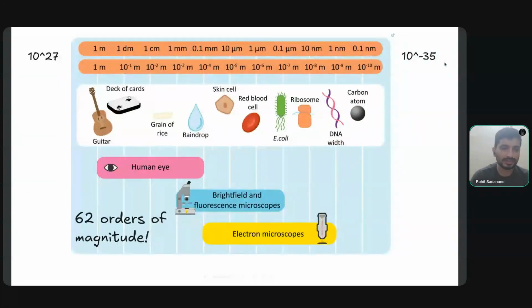Because those things that life is made up of are very tiny, and those things that affect life in a very profound manner, like bacteria, viruses, and even disease states, which we don't really understand well, but might affect a cell in a manner that is recognizable by just the look of it, cannot be seen by the naked eye, because the wavelength of light that our eyes are capable of seeing is not sufficient to look at such small details in things.